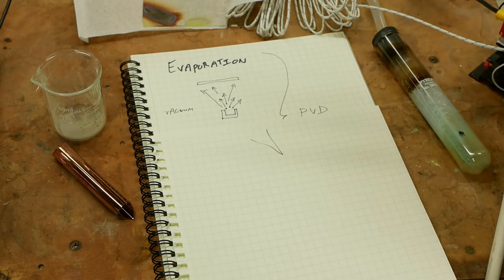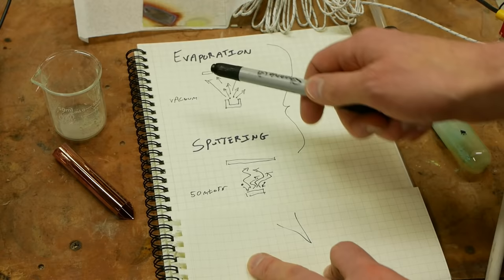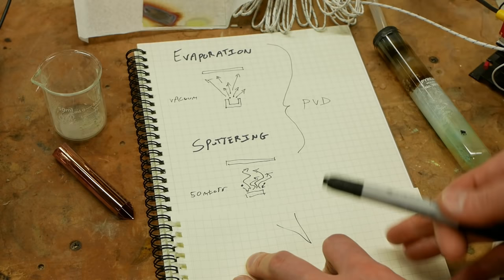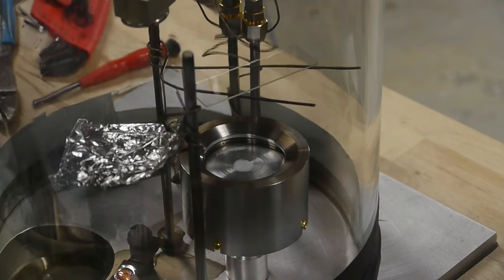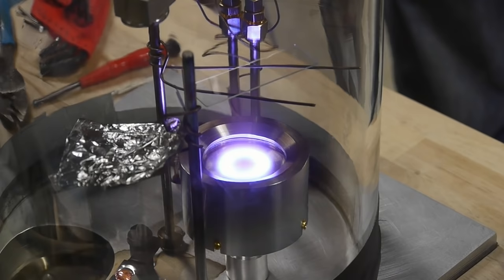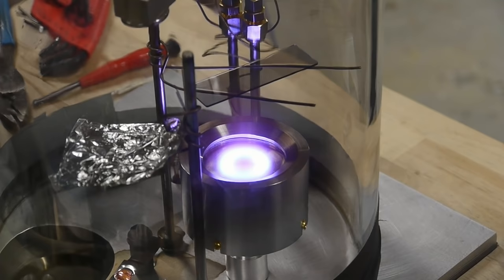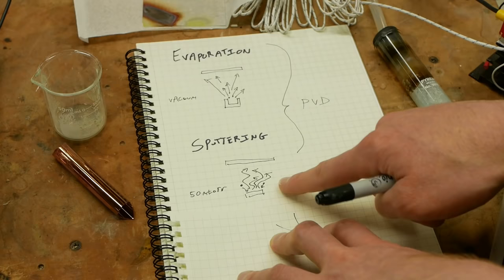So partially to address this, and also other things, the technique of sputtering is often used. Instead of operating in vacuum, we operate at lowish pressure, say 50 millitorr, let's just say for example. And the way sputtering works is we use an inert gas like argon and accelerate those argon ions into the target, which rips off a little piece of it. Let's say it's copper metal or titanium or something. And the cloud of stuff above this sputtering area is very hot. It's plasma.